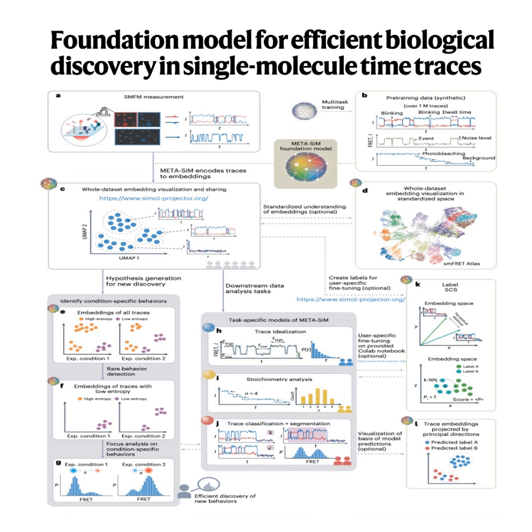So it helps standardize things. You can compare results across different experiments, maybe even different labs, using this common reference map. That's the goal. It helps avoid the apples to oranges comparison problem that can happen when everyone analyzes and visualizes their data slightly differently. Okay, visualization is powerful, but META-SiM also provides quantitative metrics, right? For quality control and discovery.